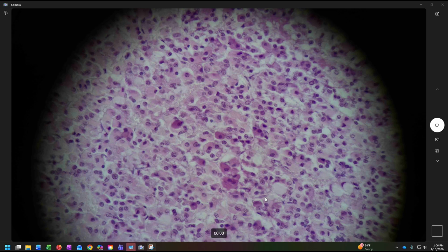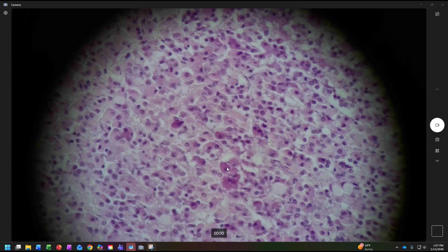But so again, we're on the anterior pituitary gland side. Again, we can see the cells, we can see the nuclei, we can see the actual borders of some of these cells. We can actually see that there looks like there's some different cells. Now, I don't know, my anterior pituitary gland histology, I'm not at that level, but I can see, if we use those observational skills, this is staining that way for a reason.